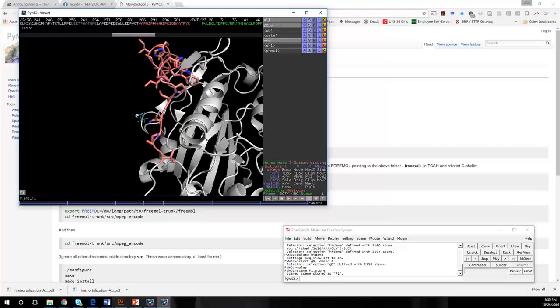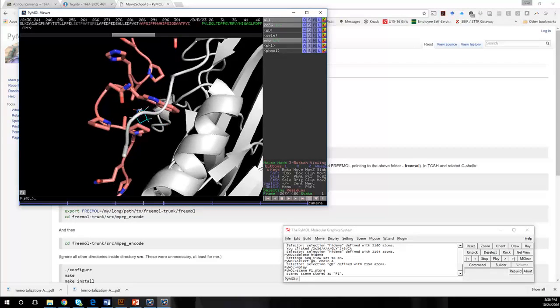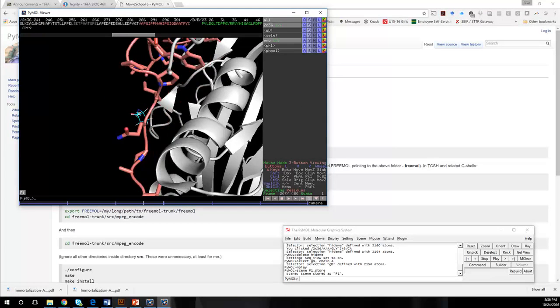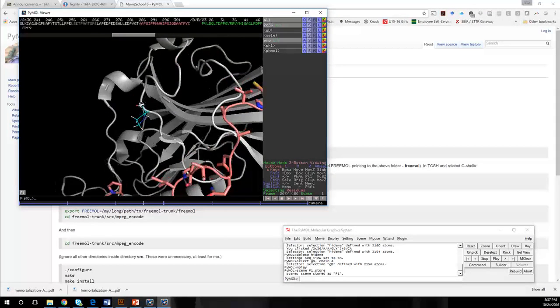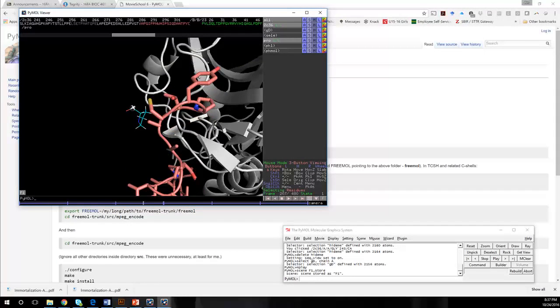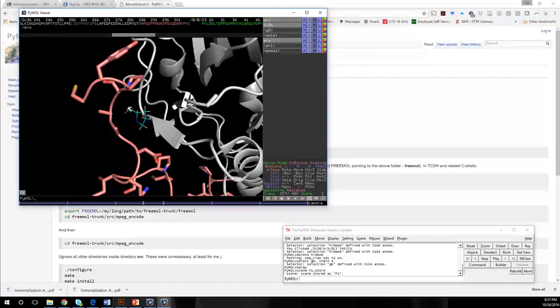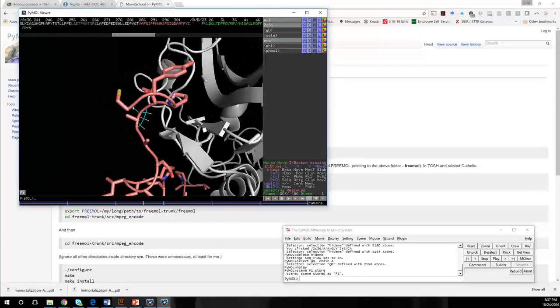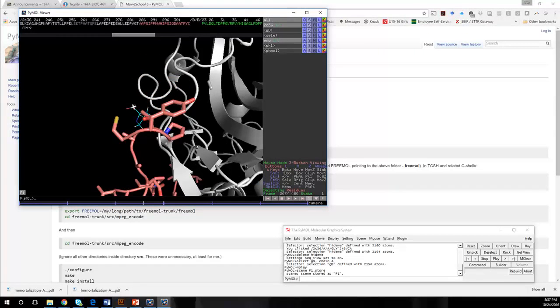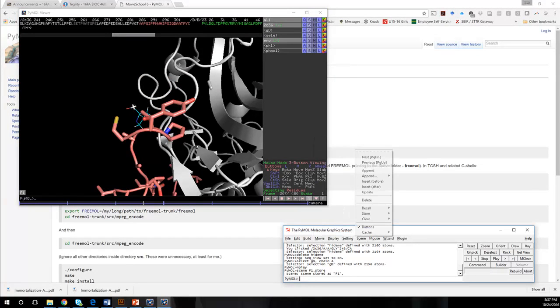And then let's pick somewhere to zoom that might have some interesting features. Looks like there's a pretty, well, I was going to say it's hydrophobic, but that's not overly true there. Well, there's a sulfur interacting. So let's zoom in on this right here. So now I'm going to go to movie. Oh, sorry. I'm going to go to scene, store, and F2.